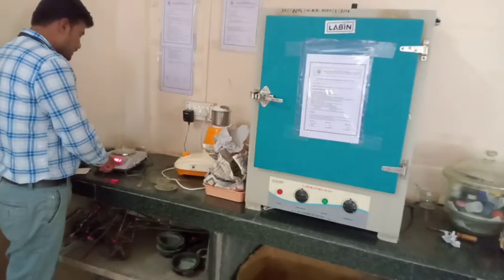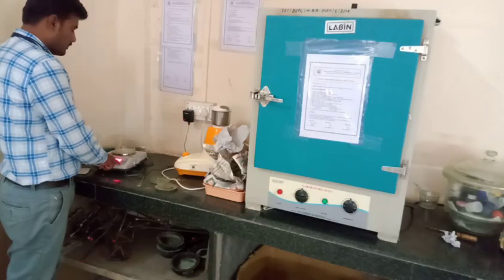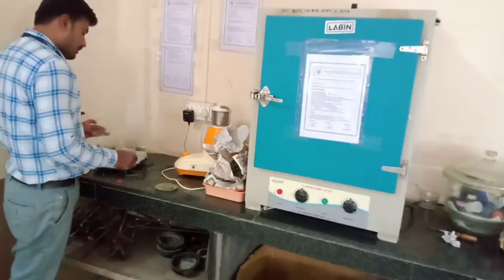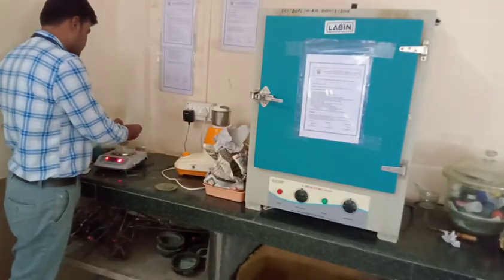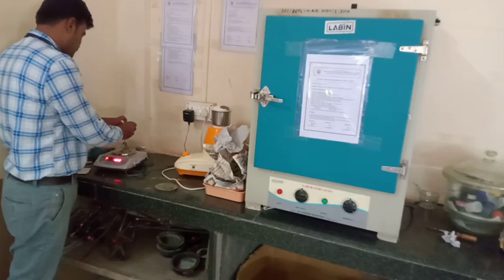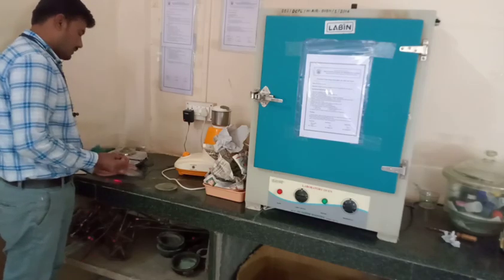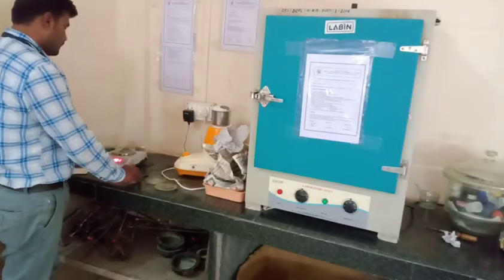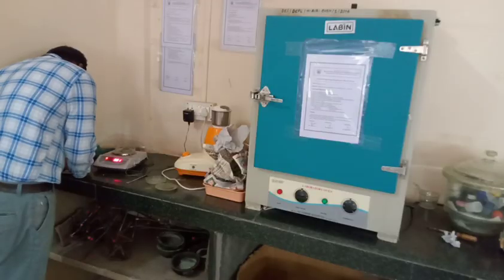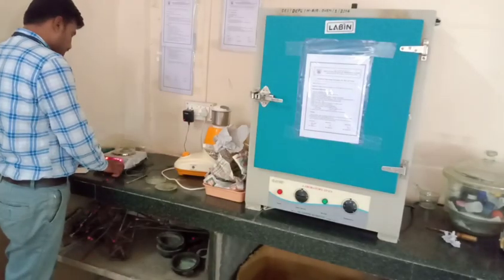Then tare the balance to 0 again and add 5 gram of plant material. So that is 5 gram of plant material.